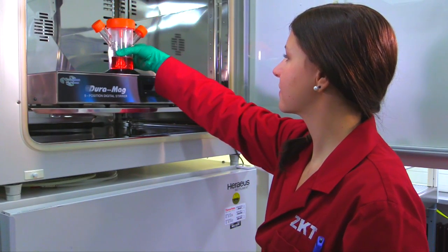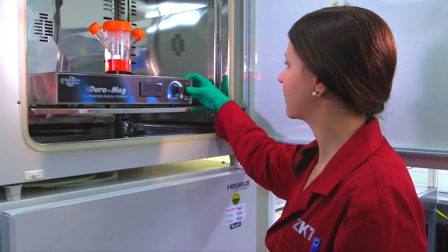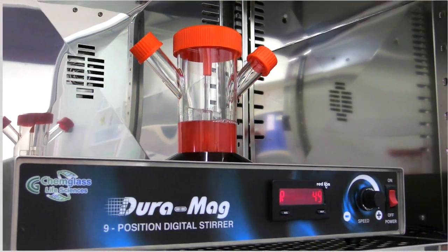Now, the spinner flasks are conditioned for one hour in the incubator at 37 degrees Celsius and 7.5% CO2.